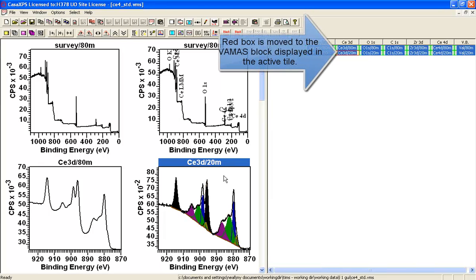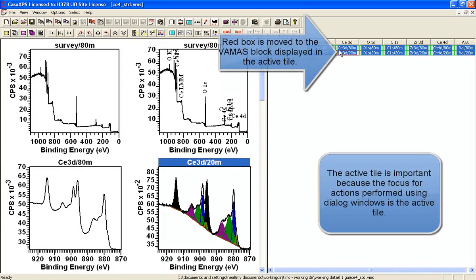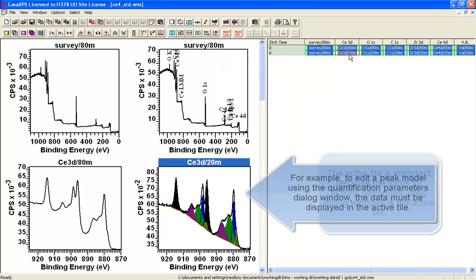The active tile has a red box indicating that the data in this VAMAS block is currently being displayed in the active tile.